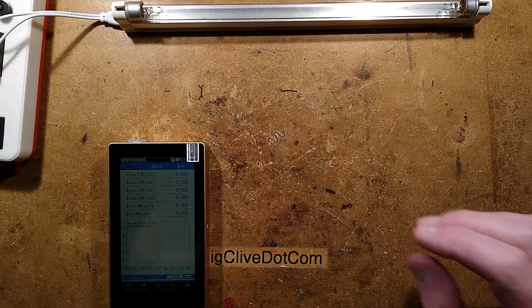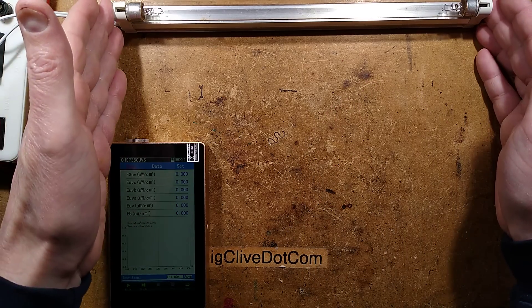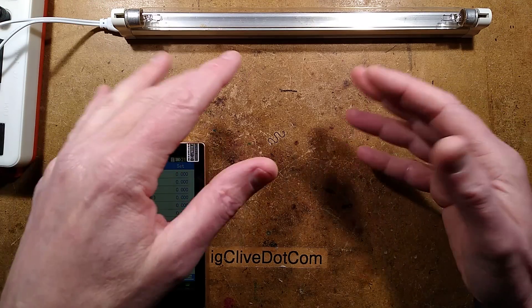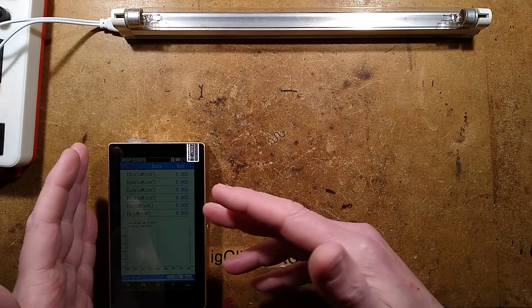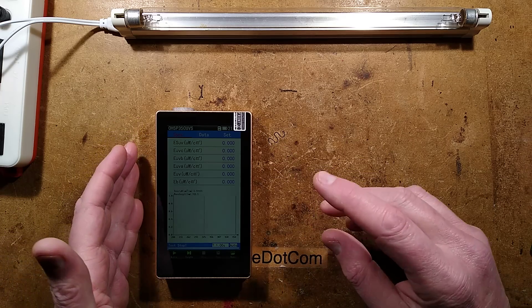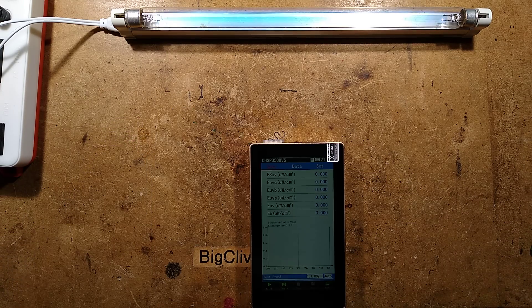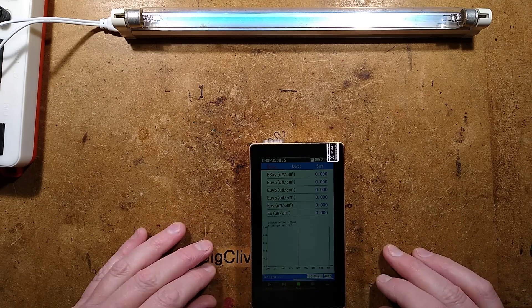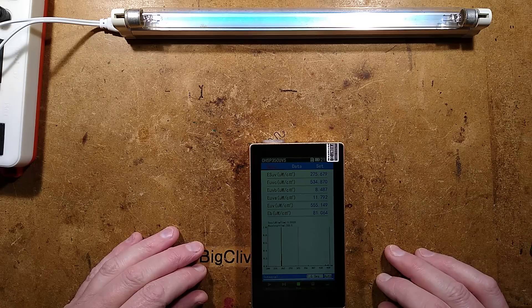For the first part of our spectral analysis experiment, I'm going to use a traditional UVC germicidal tube based on mercury vapor discharge. That should indicate approximately 254 nanometers on the spectrometer. The tube is on — I shall limit my exposure to this. I'm starting to record the spectral output, and it's already picked up that peak.